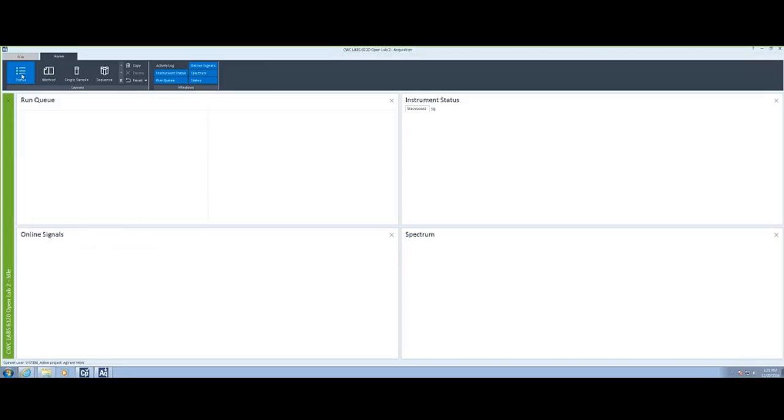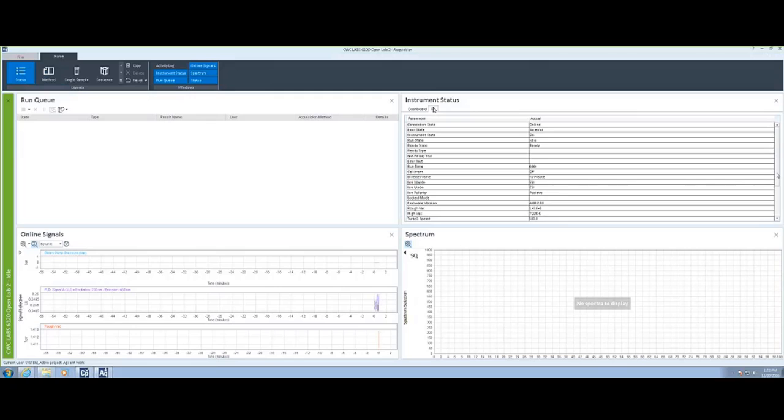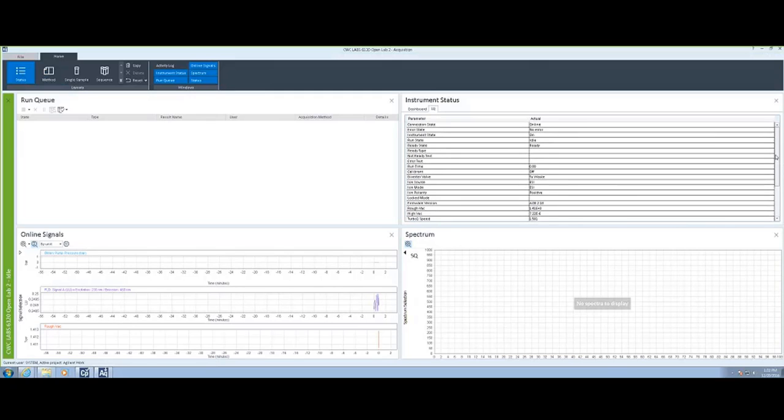This video will concentrate on Agilent's OpenLab CDS LC MassSpec Acquisition Software. From the Status Indicator, you can see the status of the LC modules as well as the MassSpec. If you'd like some additional information about the MassSpec, you can select the tab just to the right of the dashboard.